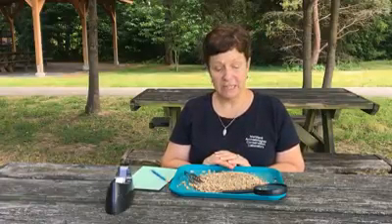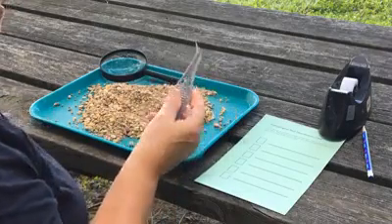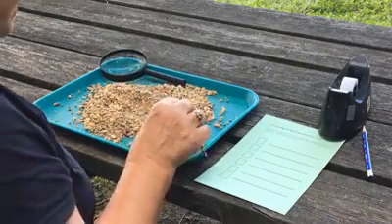Ask the students to look through the gravel for seeds. Before you do this, you might want to show them the type collection so they'll know what types of seeds they're looking for and what seeds look like, just to get an idea of that before they begin. All right, ask the students to use the tweezers to pick up seeds.